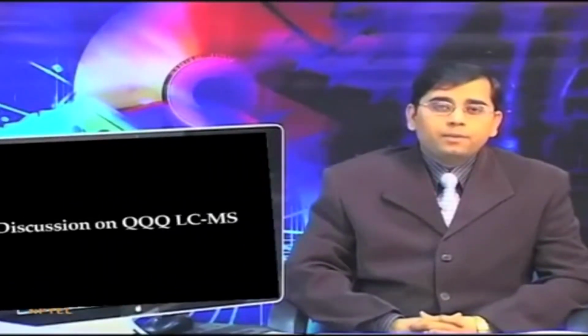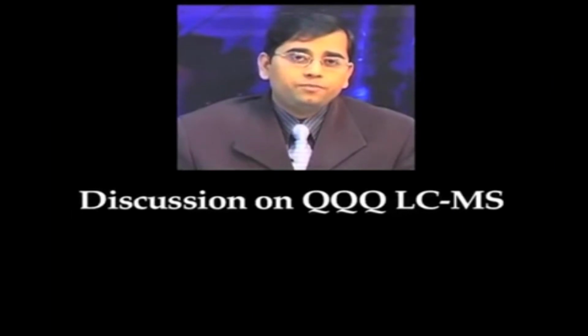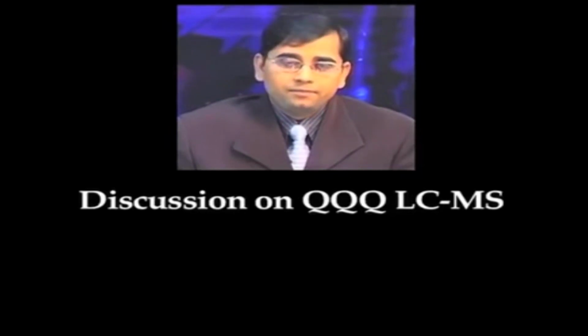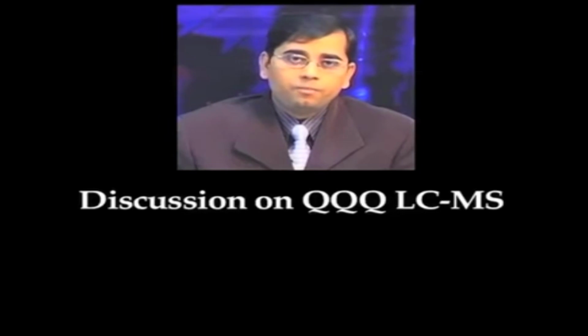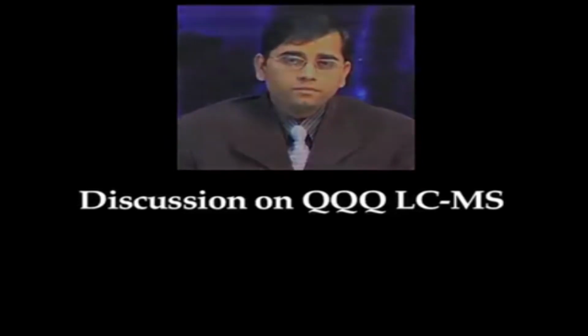So, we will discuss quadrupole time of flight and triple quadrupoles. What are the advantages of using these types of hybrid configurations? What is the latest chip technology? How can it be used to overcome several limitations of HPLC based methods, liquid chromatography, which is used prior to the ionization methods? I will discuss this with one of the leading application experts from Agilent, Mr. Abhijit, and during this short discussion and interview, we will try to provide you an overview of the latest configurations available and their advantages.